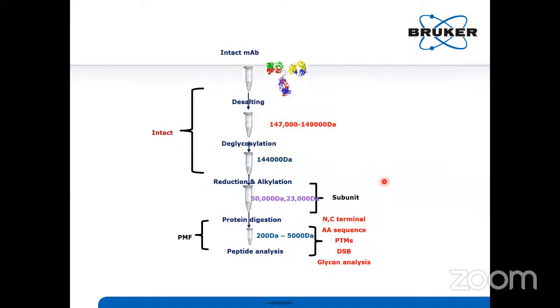This is the general protocol when you are doing your protein digestion. Intact mass, you will take it. First, you will do the desalting. You will remove completely whatever salts are present, and you will denature the protein. Normally your protein will have a curly structure, completely mixed up. You will make it a straight line. If you want to analyze the glycans, you can keep them, or if you want to remove them, you can do the deglycosylation, and you can do the reduction completely. Whatever cysteine bonds are there, you will break the bonds.